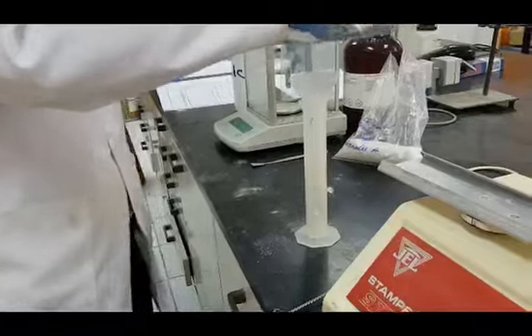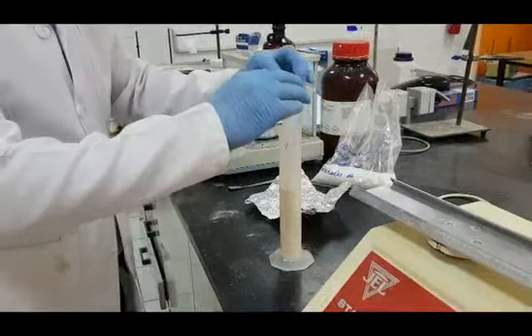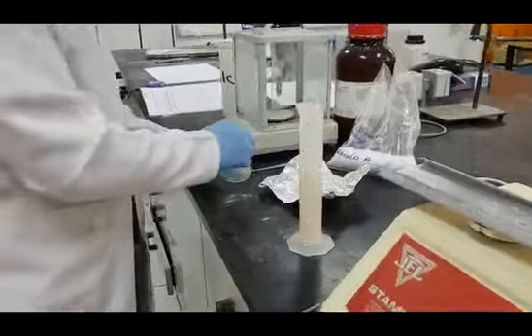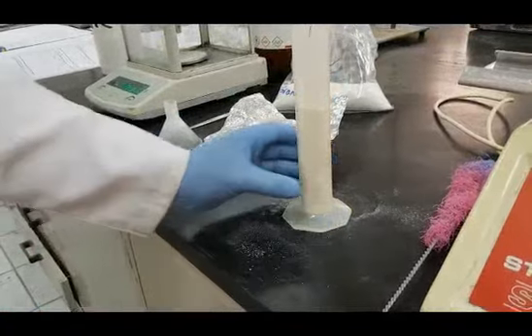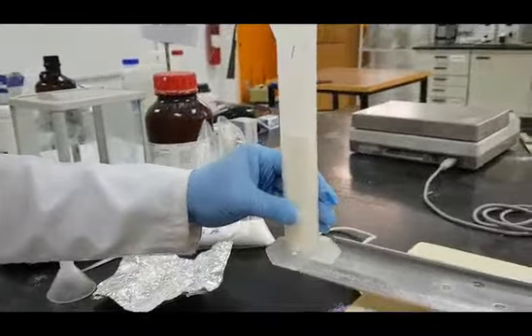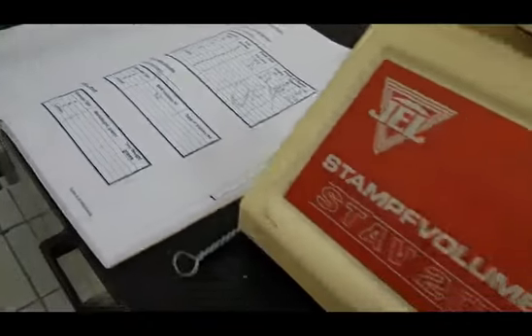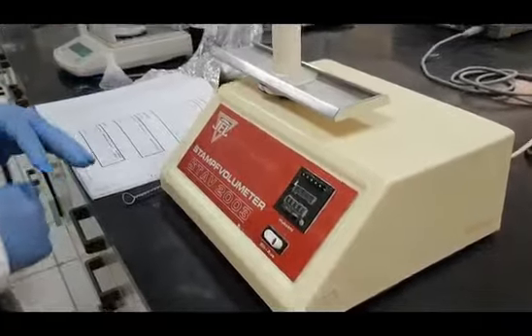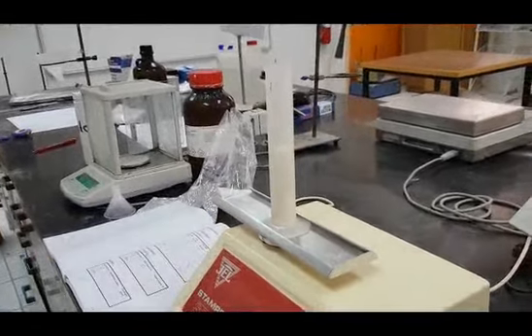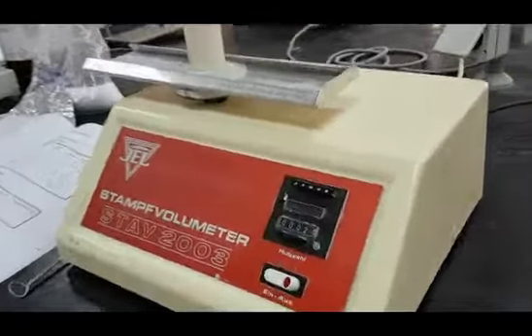Please use the same procedure you are watching. Measure the bulk volume. If any uneven surface appears, please do maximum 2 taps manually and measure the bulk volume. This is called bulk, untapped, or poured volume. Attach it to the tap density apparatus. Make sure to calibrate the tap density apparatus before you start counting the taps.